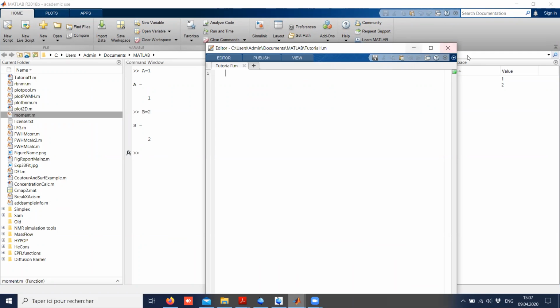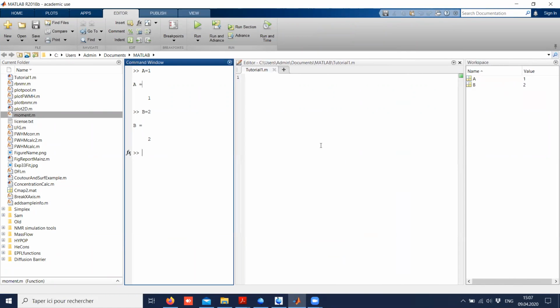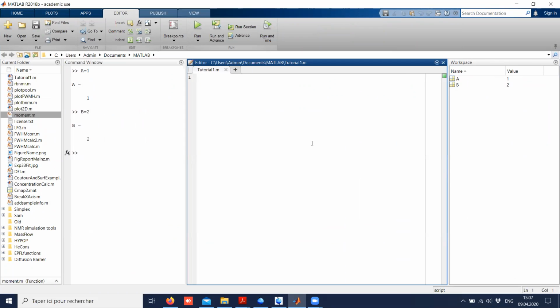No. Doc, yeah. So this is more convenient because now what I will do here will be applied here, and you will see better what is going on. So it's always good to explain what you're doing.